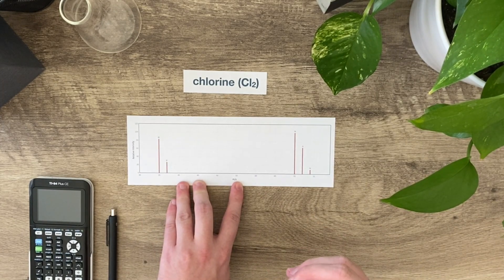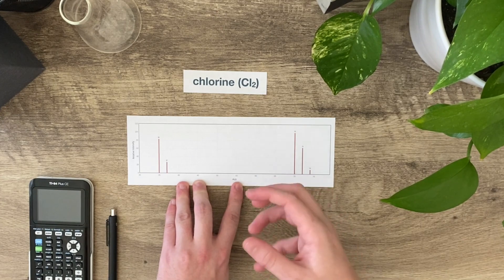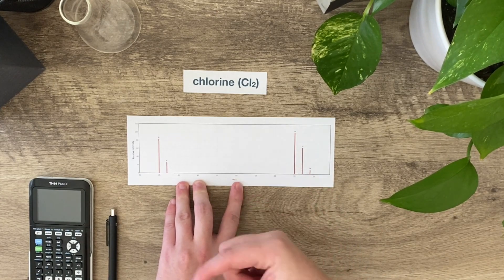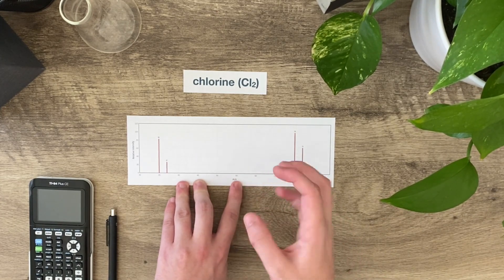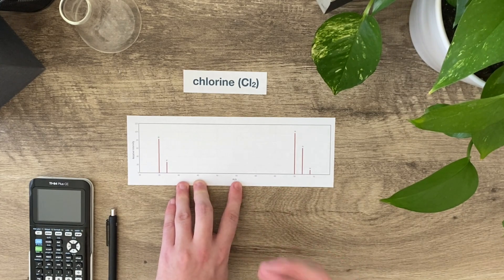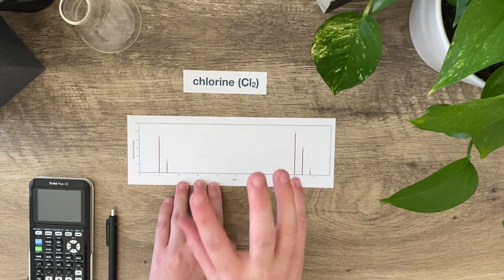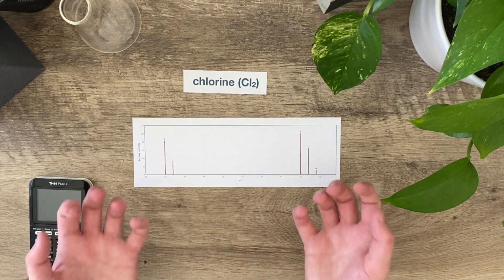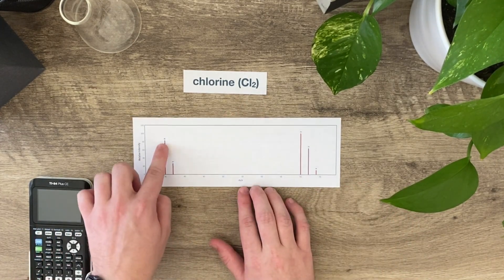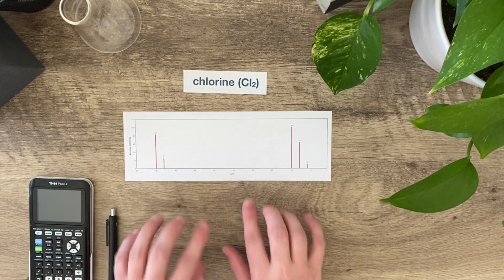Sometimes when it becomes ionized, that charge wants to be distributed very quickly through the molecule, so the molecule will separate and fragment. These two peaks are associated with fragmentation. When I put Cl2 in there, it actually separates into two Cls, which is why I have 35 and 37.